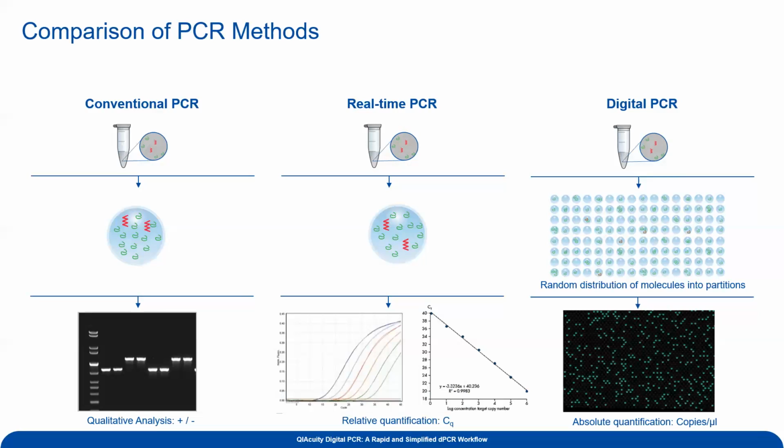So this is a really great technique in molecular biology for doing things like relative comparative measures. So if you want to say that I have in treatment A a 2 or a 10-fold upregulation of my genes relative to treatment B, which is my control, qPCR is a great tool for that, right? Because you're not necessarily saying I have 10,000 more copies or 50,000 more copies of my transcript or my genome of interest. You're just saying on a relative scale, I have more compared to a control.